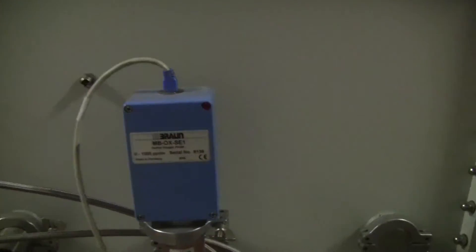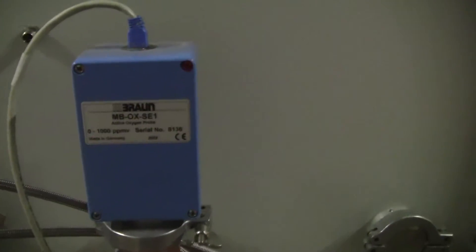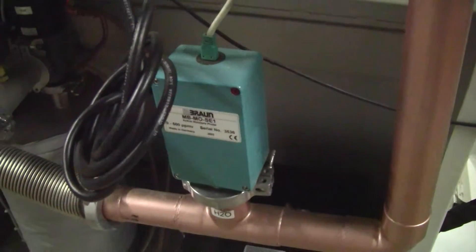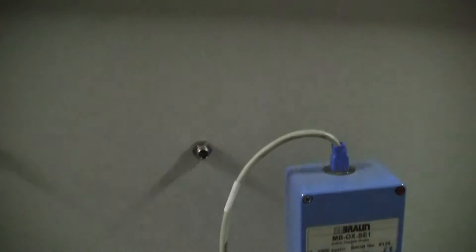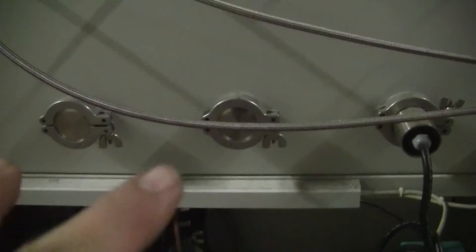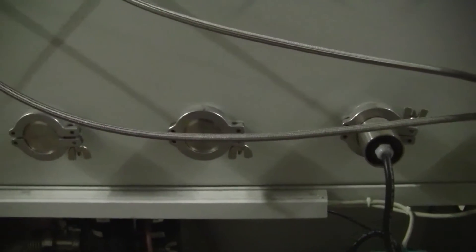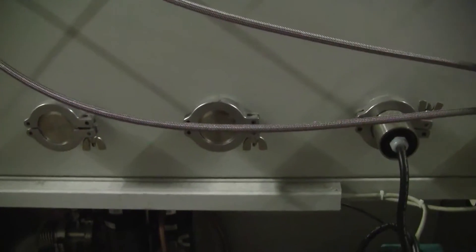In the rear of the unit, we've got the oxygen probe, the moisture probe. As I was indicating, ports in the back to introduce either liquid or gases. We've got some additional other ports there that can also be hooked up.